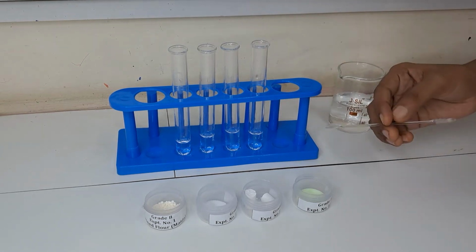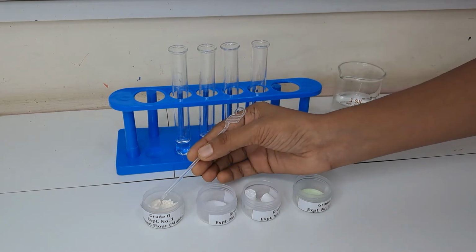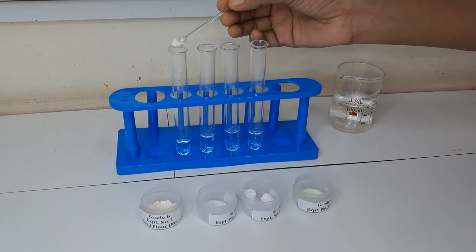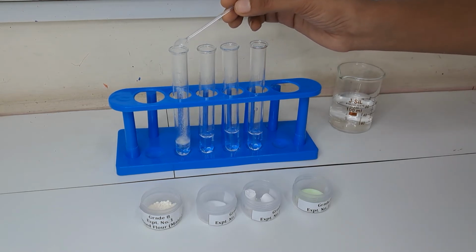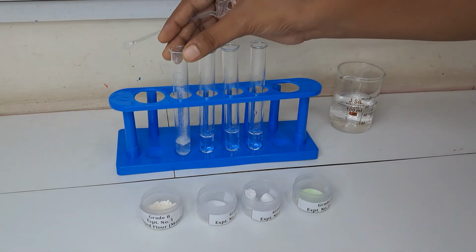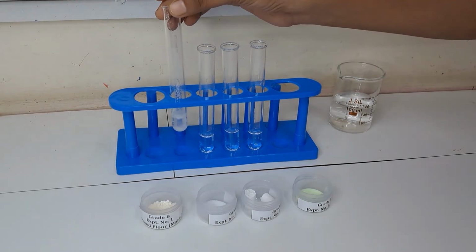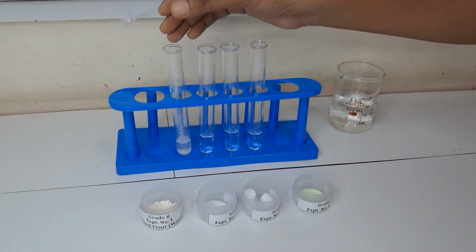Now first we are going to try with refined flour, that means maida. You have to take half a spatula of refined flour and add it to the first test tube. Now you have to use your sense organs and observe what exactly happened when you added that refined flour in the water. You have to use your eyes, ears, nose and touch. Don't taste the substance. You have to just touch it.